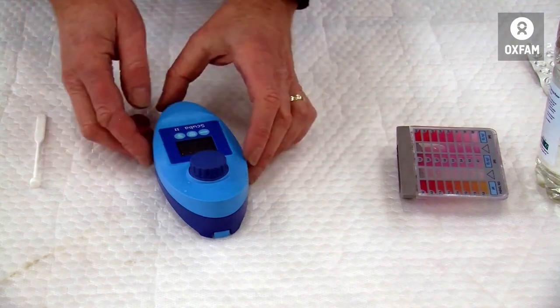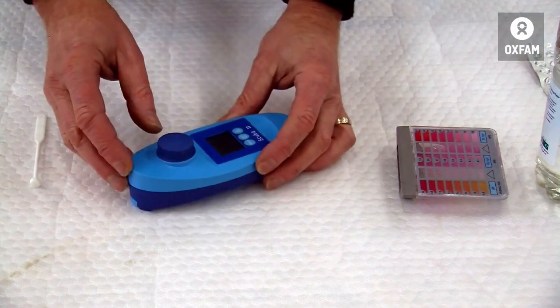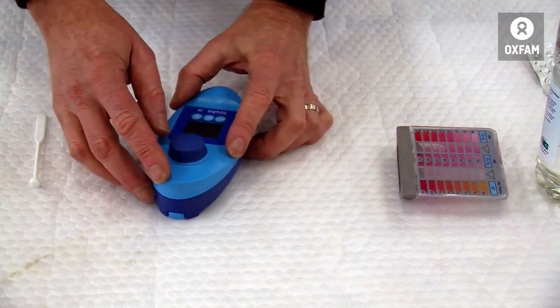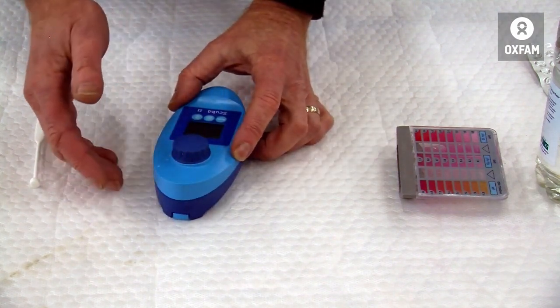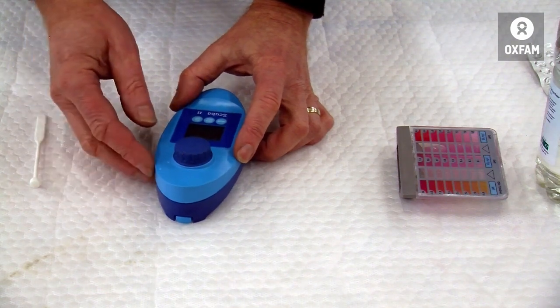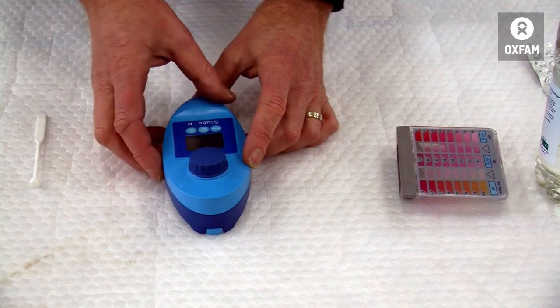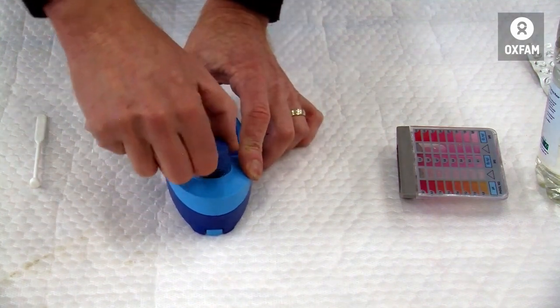So with the photometer it's the same thing. The photometer passes a beam of light through the sample and will measure the difference between the plain sample and the one where you've added your reagent. So we'll switch it on and we'll add the sample water.